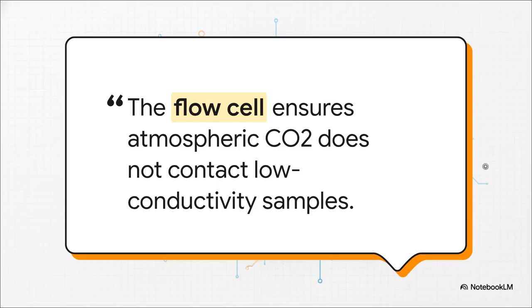And this right here reveals just how delicate this science truly is. When you're measuring ultra-pure water, even the ambient air in the room is a threat. If atmospheric carbon dioxide, or literally just the breath you exhale, contacts the sample, it dissolves to create carbonic acid. That immediately introduces new ions and completely falsifies your low conductivity readings. No way around it. That's exactly why specialized closed-system flow cells are mandatory for pure water testing.